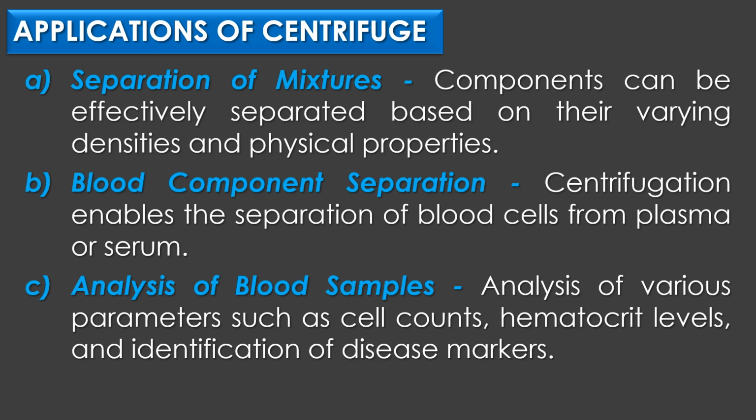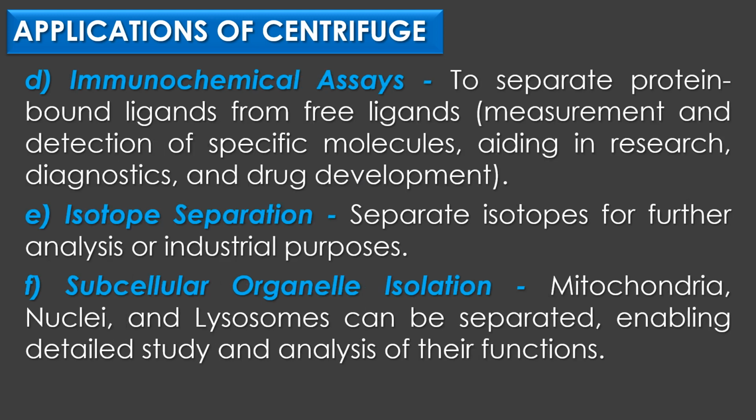The third application of the centrifuge is analysis of blood samples. Centrifugation plays a vital role in laboratory analysis. By separating blood components, it facilitates the analysis of various parameters such as cell count, hematocrit levels, and identification of disease markers.